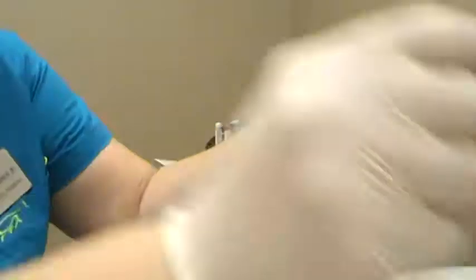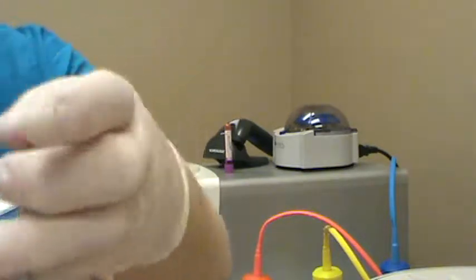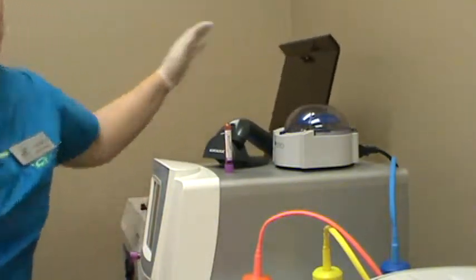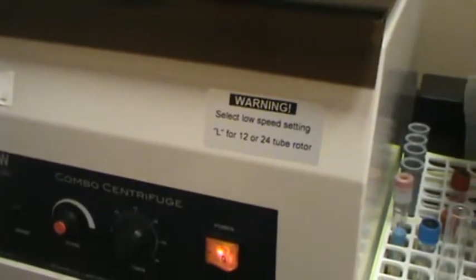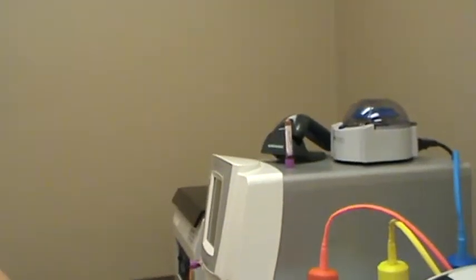With the clot rimmed, we find a balance tube — it looks even — and place the serum separator tube into the centrifuge, locking the lid down tightly. According to manufacturer's instructions, we run blood at 4,000 RPMs for seven to ten minutes, starting on low and setting the timer for seven to ten minutes.